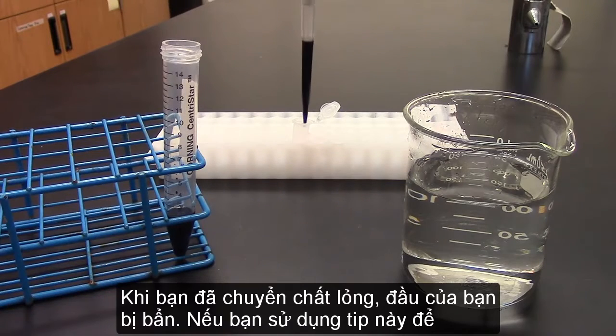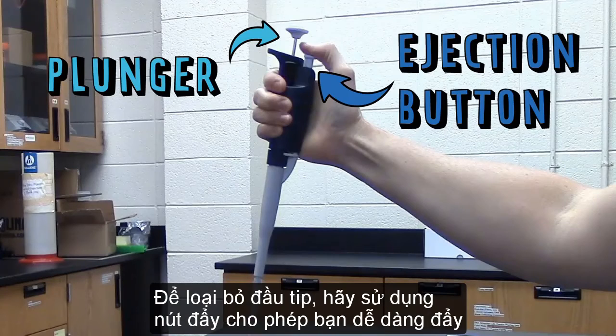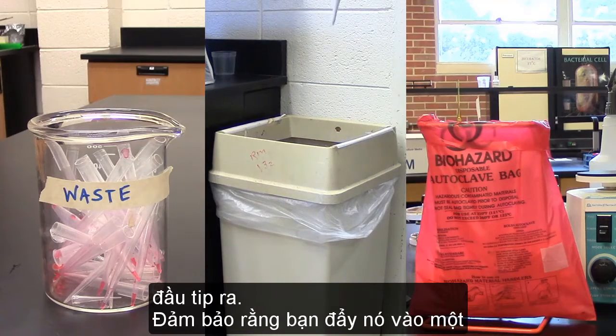Once you've transferred the liquid, your tip is dirty. If you use this tip to transfer a second liquid, you'll contaminate the second liquid. To get rid of the tip, use the ejection button, which lets you easily eject the tip. Make sure you eject it into an appropriate container.